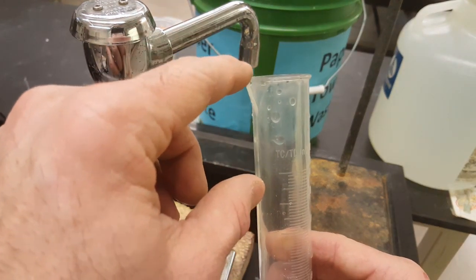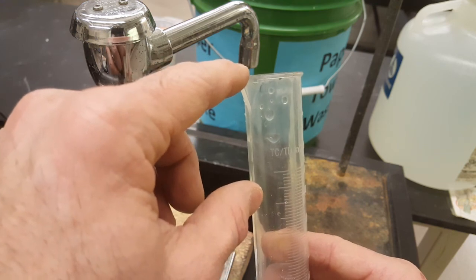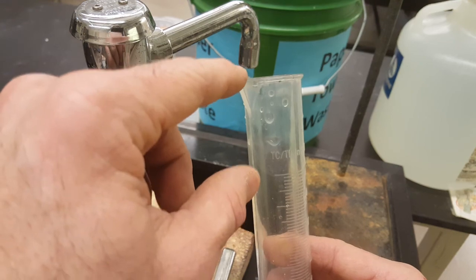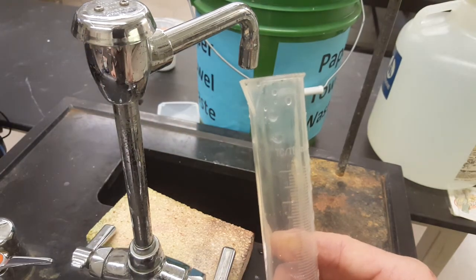And we've given you more acid than you need today. So it's okay if you spill a tiny little bit, but try to get that dish of water on the top.